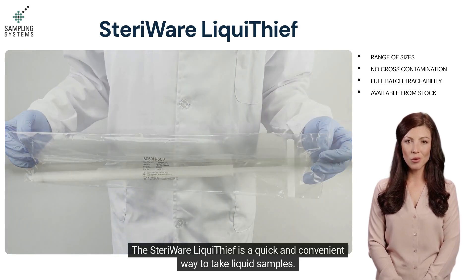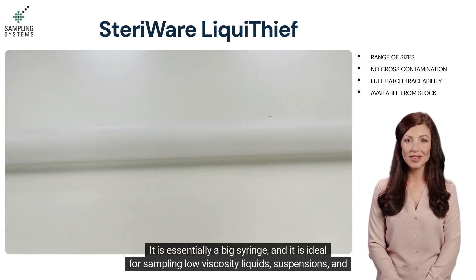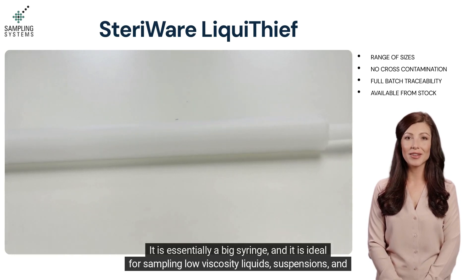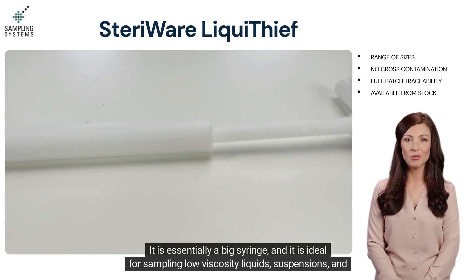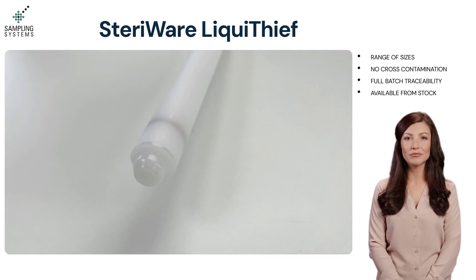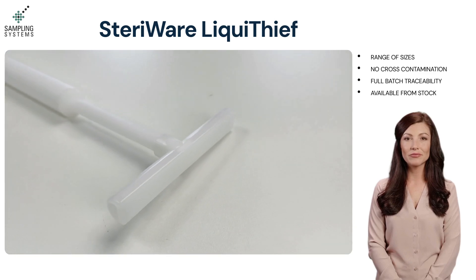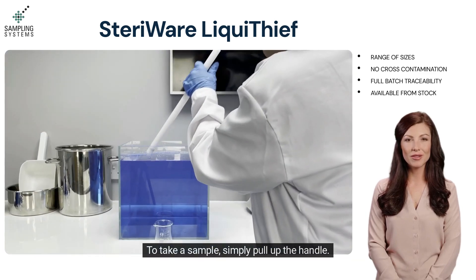The Stairware Liquid Thief is a quick and convenient way to take liquid samples. It is essentially a big syringe, and it is ideal for sampling low viscosity liquids, suspensions, and thin oils. To take a sample, simply pull up the handle.